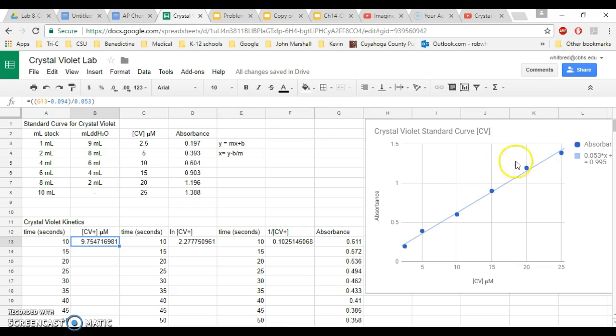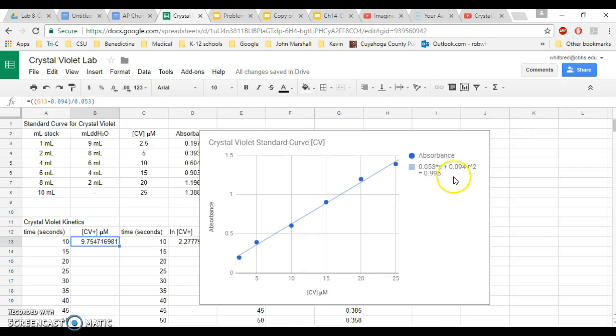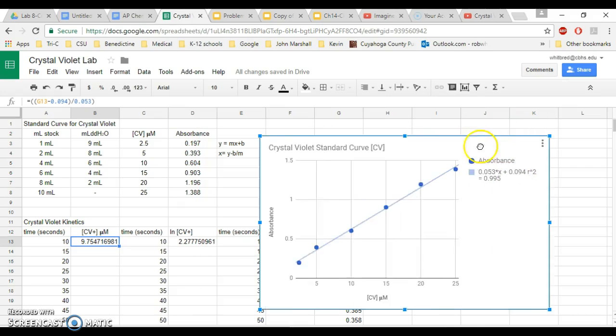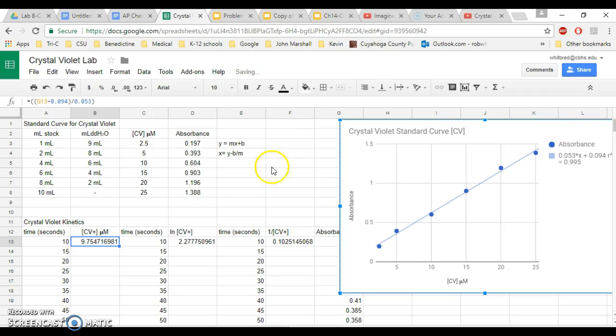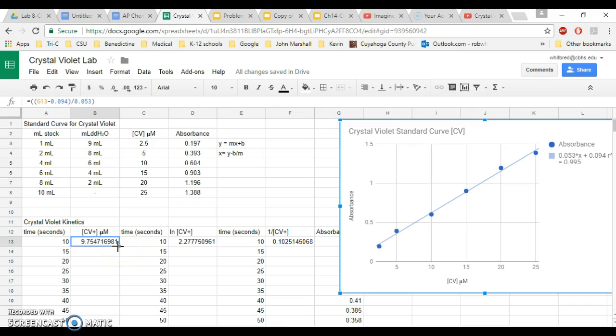You're going to subtract 0.094, and the reason is because 0.094 is the number that is the intercept, the y-intercept. And then you're going to parentheses that whole thing so that is done first, and then you will divide by 0.053, which is the slope. If you set up that formula correctly, when you hit enter, you should get a number that makes sense to your graph.